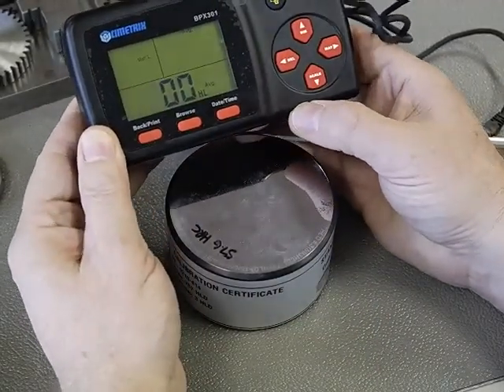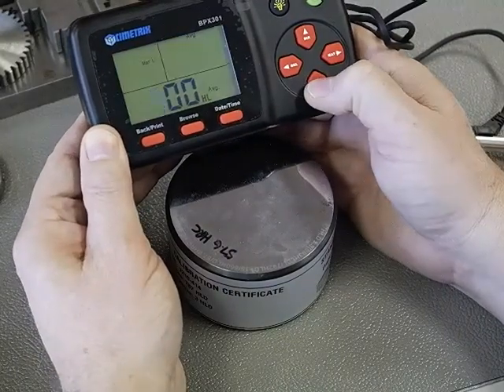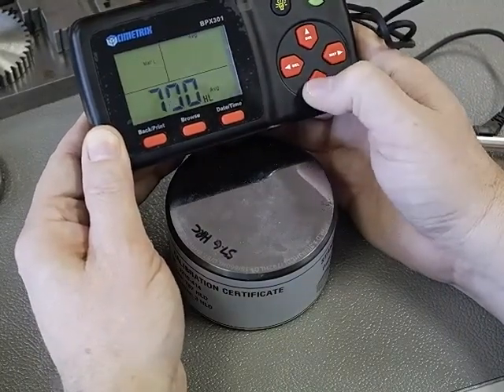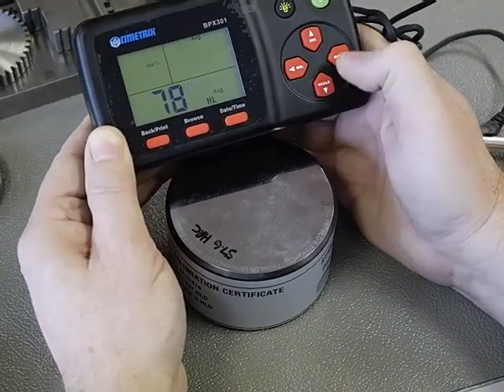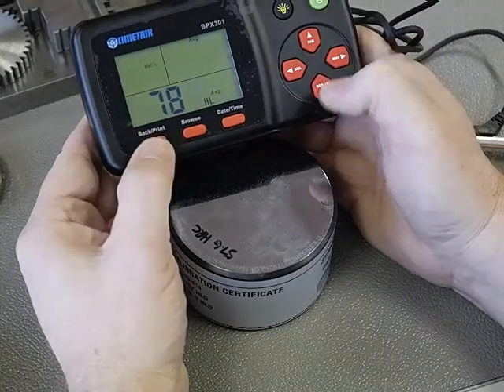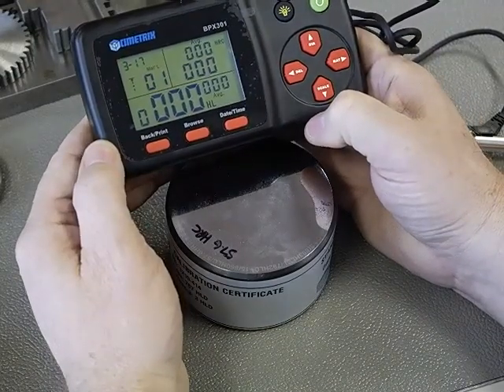Your block will be different so you would put in that number. We're just using the cursor control keys: 7, there is 7, go across, 8 — oops too far — 8, and then 7. To complete this all we have to do is hit the back button and the unit is calibrated. It's as simple as that.